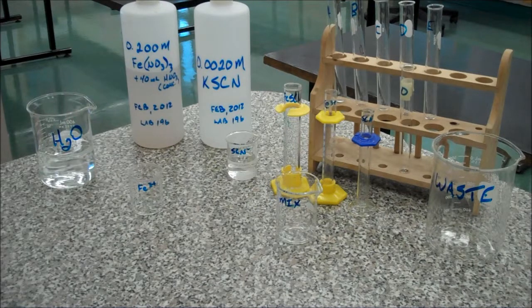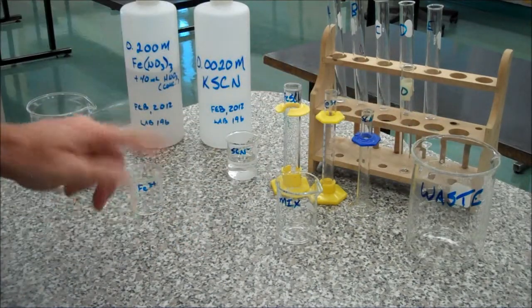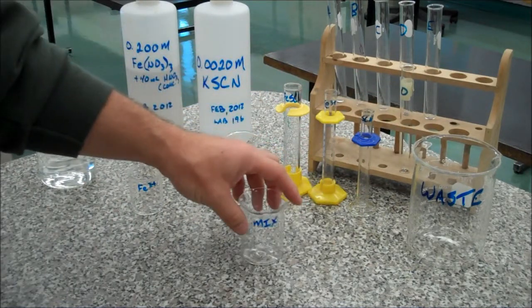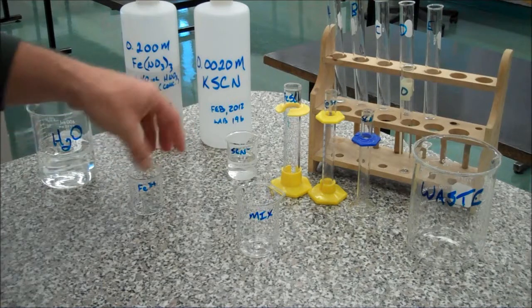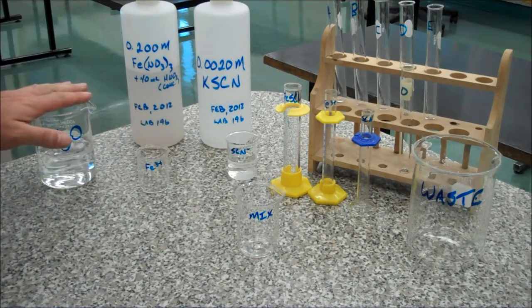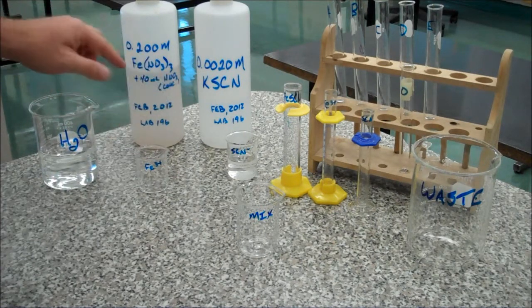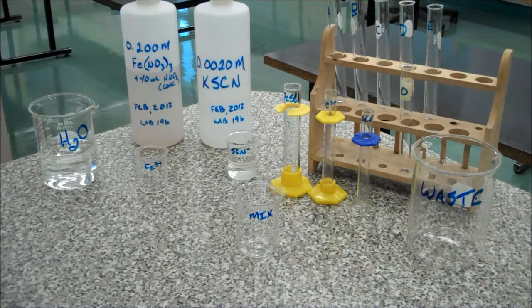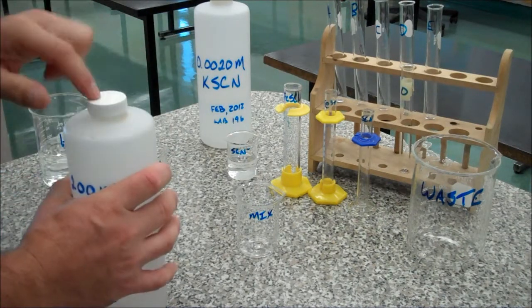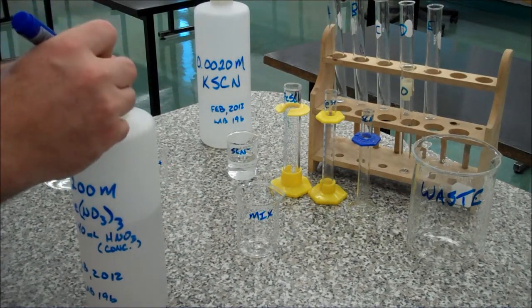Okay, so we've got our glassware laid out. We need a waste container — notice everything is labelled. We need a waste container, a container to mix our solutions in, the iron and the thiocyanate iron. We need distilled water, approximately 30ml of each of the two reagent solutions. It's important to keep track of the cap as well — I'll just write down on there, this is the iron cap.